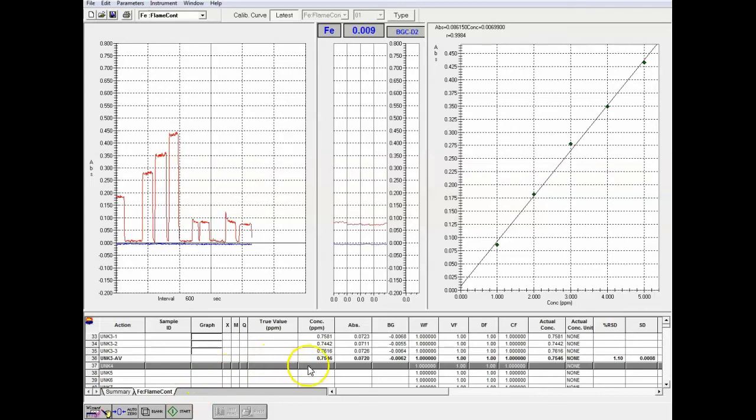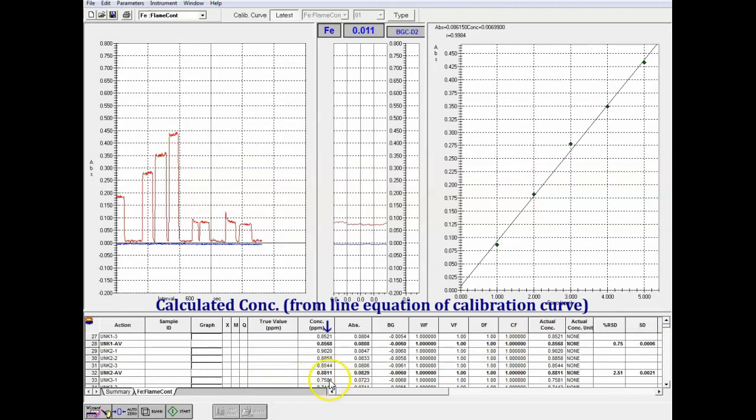So if you look at the data table down here, based on our calibration curve and based on the absorbance, it gives us a calculation for concentration. So you can do this the same as you've likely done in other labs by just calculating it from the equation. But this machine actually does it for you. So that's nice as well. So it's telling us that it's about 0.7 for a concentration for that unknown sample. If we scroll up, we see the other one was 0.8811 and 0.8568. So they're relatively close to each other, okay, because remember they were the same sample.